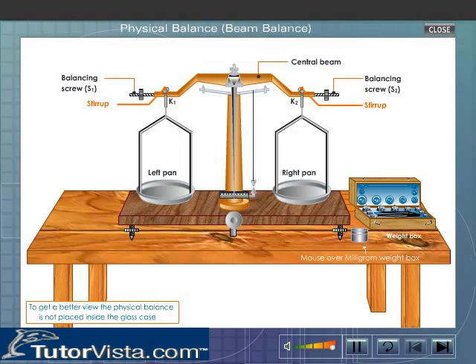In the middle of the beam there is a central knife edge which points vertically downward. There is a central pillar mounted on a wooden base. At the bottom of the wooden base there are leveling screws.